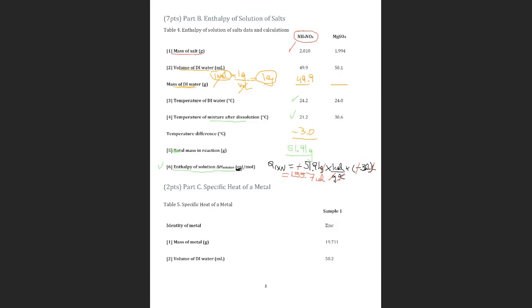So, when you are calculating enthalpy of solution, how do you come up to say you only calculate for the salts but not everything? Okay. First, this is the Q of the reaction. Basically, how much heat was released in the calorimeter.